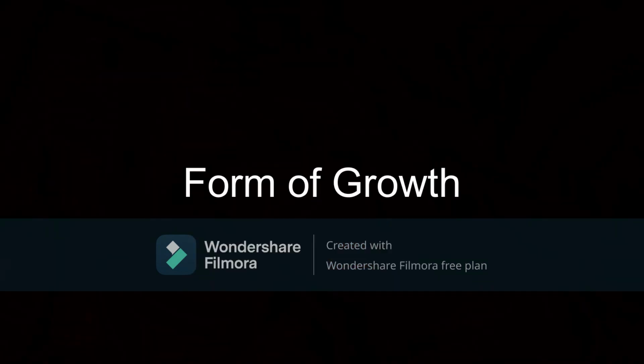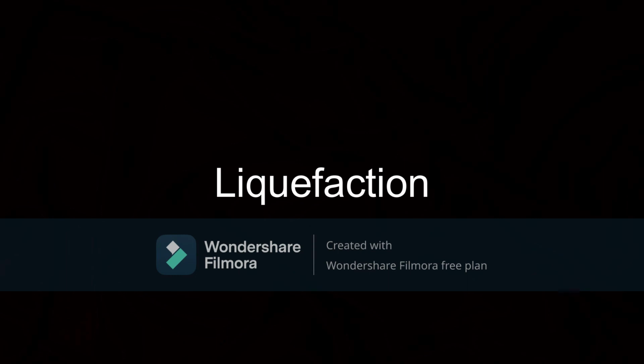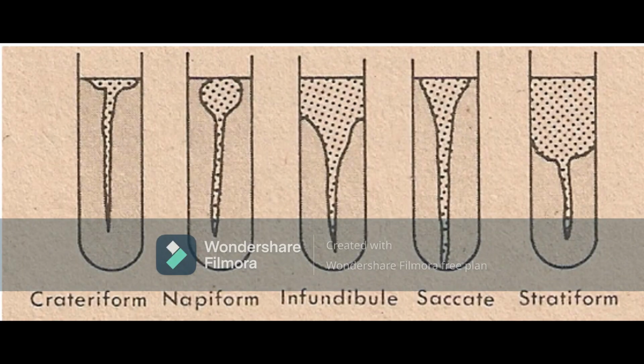Form of growth. In the form of growth, it can be filiform, beaded, papillate, villous, or arborescent. Liquefaction. In liquefaction, it can be crateriform, napiform, infundibuliform, saccate, and stratiform.